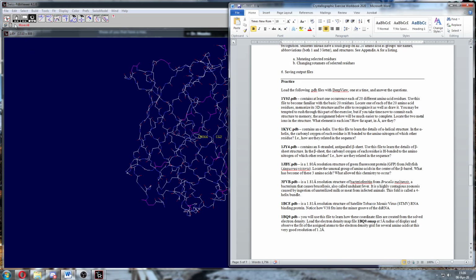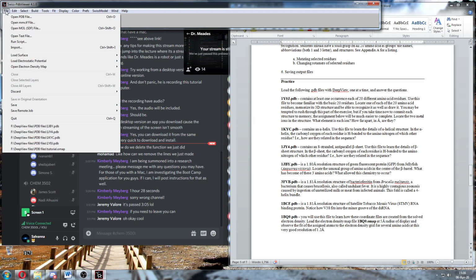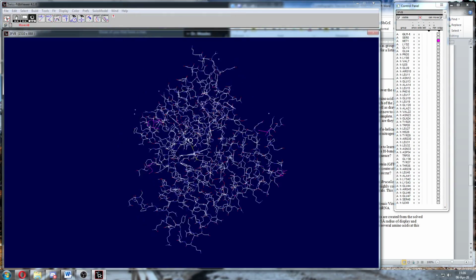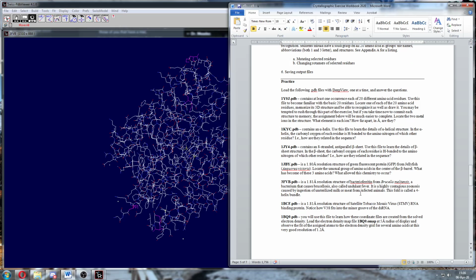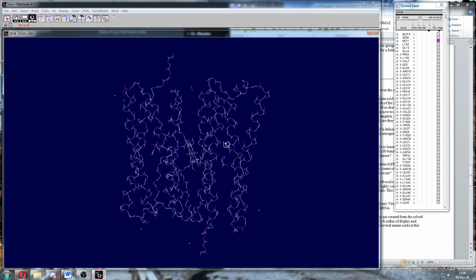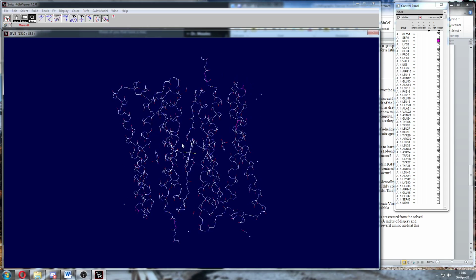Okay. All right, let me show you a couple more and then we'll get to your exercise. Let's close this one. I want to open 3FVB. Okay. So this one looks rather complicated. It's showing all sorts of things again, but let's eliminate some of the clutter. So let's take off our R chains one more time. And you'll notice that this is made of a bunch of alpha helices. It's not a stranded beta sheet here. These are alpha helix. Right here, many, many more of them, a whole bunch of alpha helices throughout here.